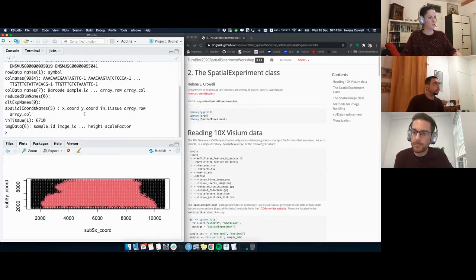Kelly said I cut out after coloring cells. Okay, sorry, yeah, so the rest of the code is there in the HTML if you want to continue with that exercise. I don't know if that was me or if that was for you. I mean, I was just going to continue.